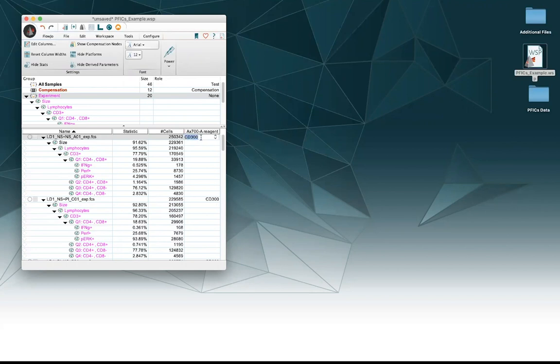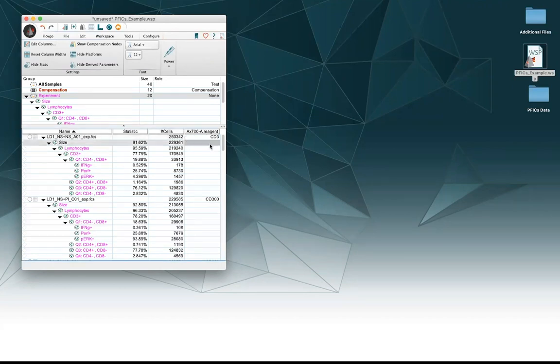So here's the stain name, CD300. If I just click on it, I can change the name that way. Just delete the two zeros. Now it's CD3, perfect.